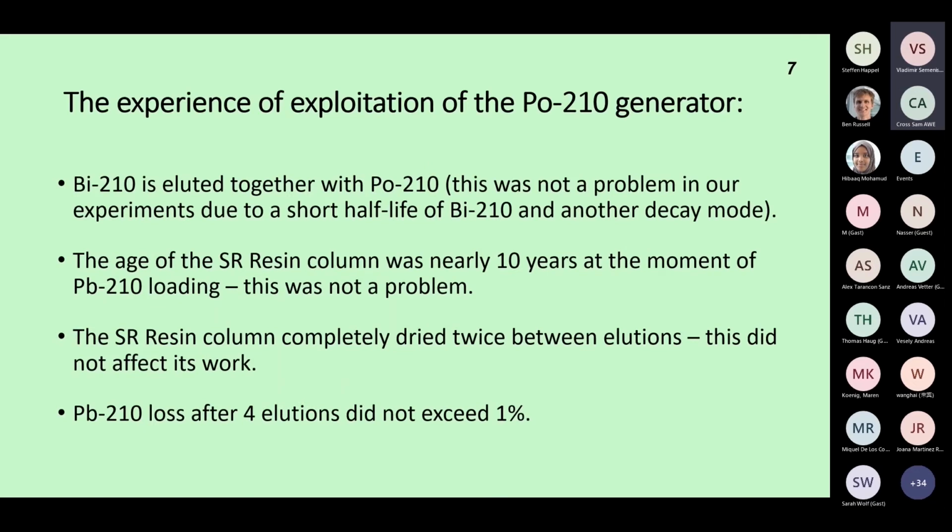And so here is our experience of exploitation of the polonium generator. I would like to point out four points. First, bismuth is eluted together with polonium. However, in our experiments, it was not a problem because our experiments with students were focused on measurement of alpha activity of polonium.